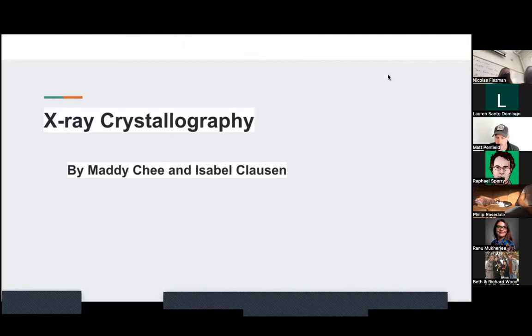All right. Hi, everyone. So today we'll be giving you a basic introduction to X-ray crystallography. We had found an article about a lab in Berkeley doing research into this topic, and yet we found out quickly that it involved much more mathematics than we were prepared to put in. So we've decided to try to explain it in the simplest way possible.